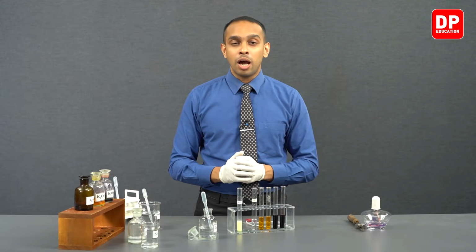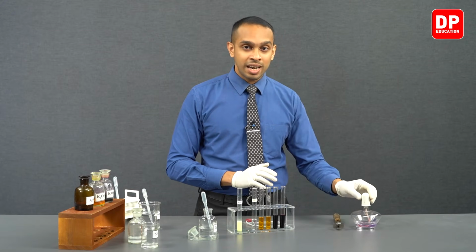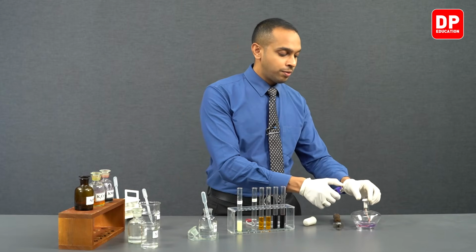So that is why the purple color solution will become colorless, and sulfur dioxide will get oxidized to sulfate ions. To make this reaction happen a little faster, we can use a spirit burner and heat up the entire mixture as well. So let's prepare for that first.